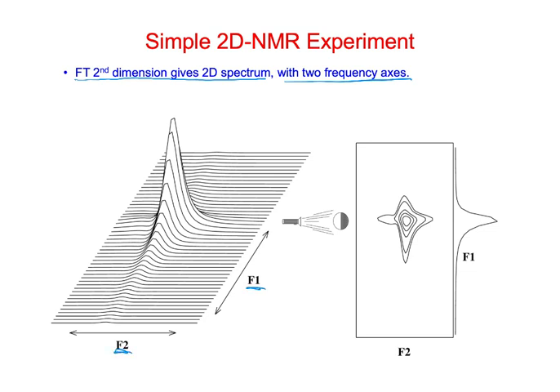Okay, and so now we go to the frequency domain. We have F1 and F2. So F1 comes from T1. F2 comes from T2.